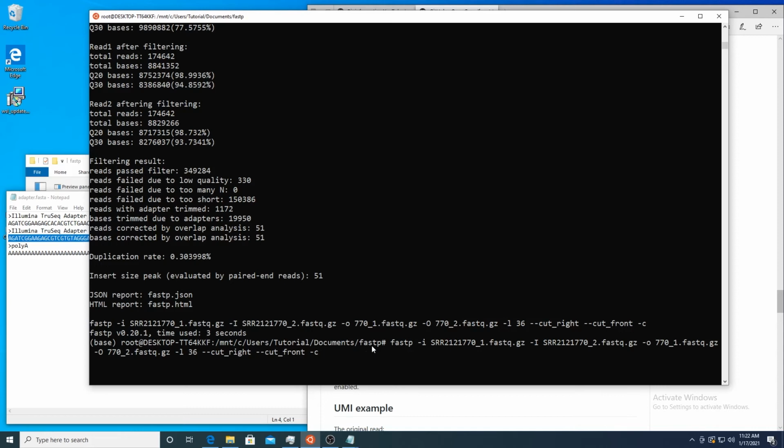And then something else that's kind of handy here for fastp is overrepresented sequences. Back when we did our FastQC video, I believe I talked about overrepresented sequences and when they may or may not be expected, and when they could or could not be a big problem. In DNA sequencing, you probably wouldn't expect many, if any, overrepresented sequences unless you did some kind of enrichment like ChIP-seq, because then you're selecting out a subset of reads from basically the whole genome.